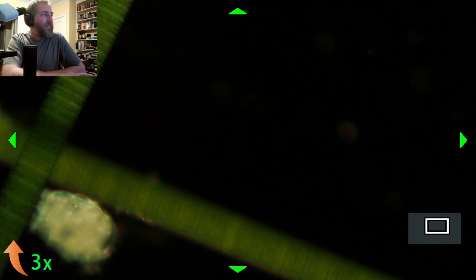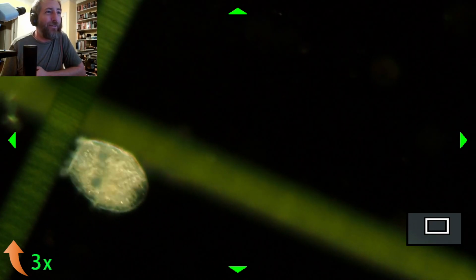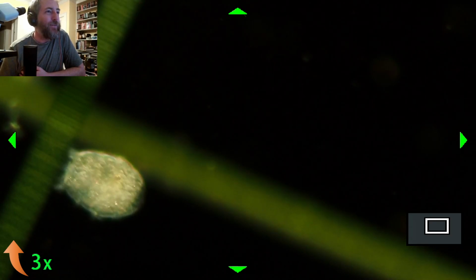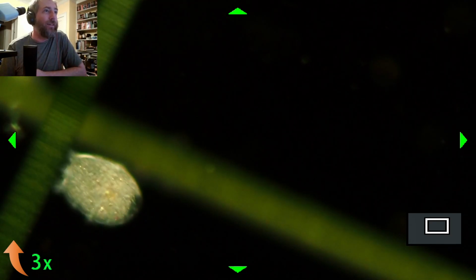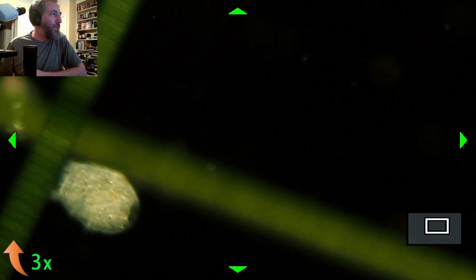It's about to slide off of my field of view, so let me move it a little bit. Well, that's what the organism actually looks like. Pretty cool. I don't know that it's biting it. It doesn't have any teeth. It's that little cilia that it uses to funnel stuff into its mouth, and also that's how it moves around. So, just doing a little bit of late night microscope work.